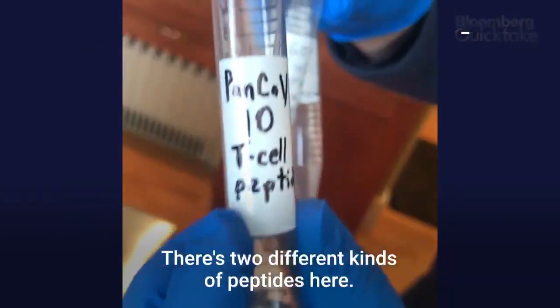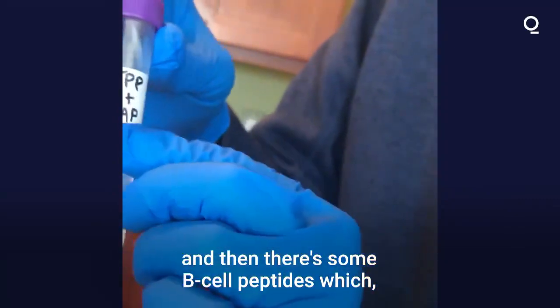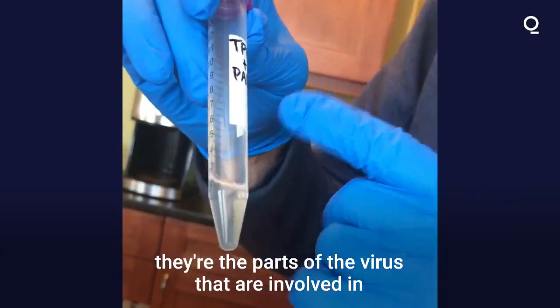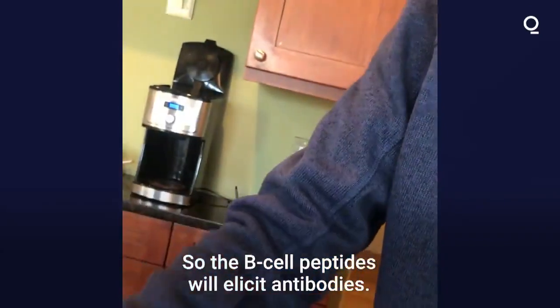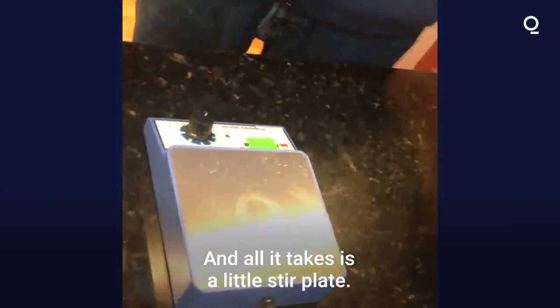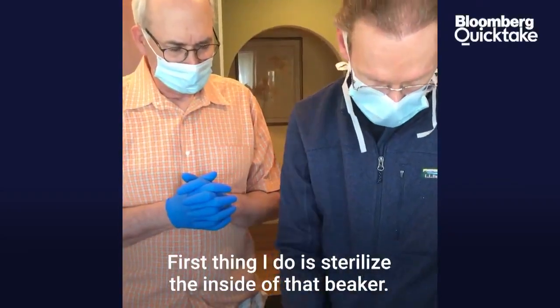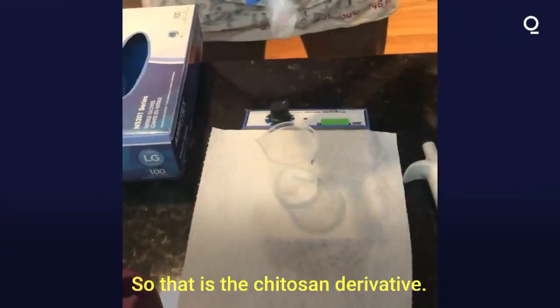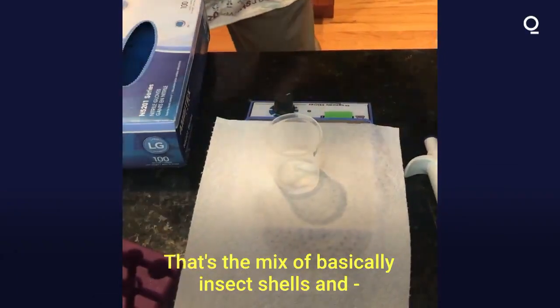There are two different kinds of peptides here: T cell peptides, and B cell peptides — the parts of the virus involved in interactions with your immune system. So the B cell peptides will elicit antibodies, and all it takes is a little stir plate. First thing I do is sterilize the inside of that beaker. So that is the chitosan derivative — that's the mix of basically insect shells and shrimp parts.